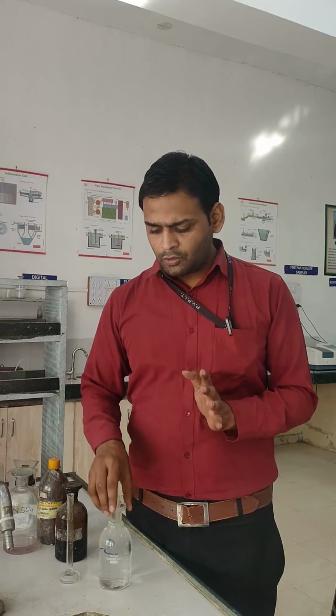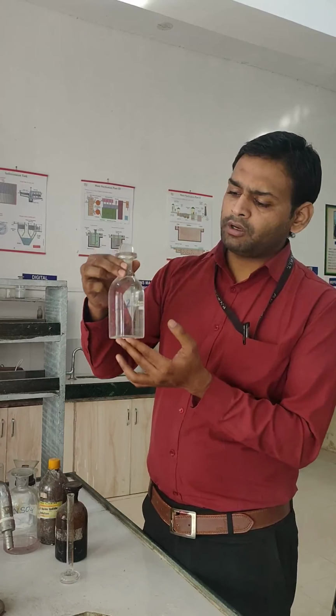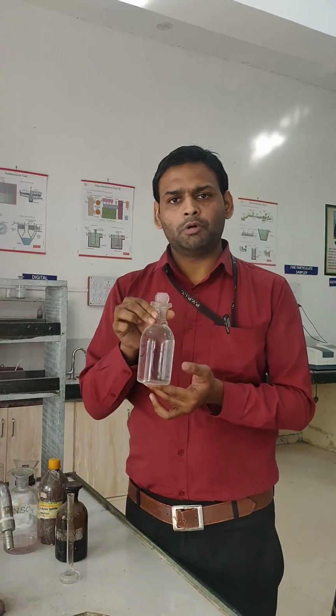So what is the procedure? First, we have to take the water sample in a closed container. This is a BOD bottle, a 300 ml BOD bottle.